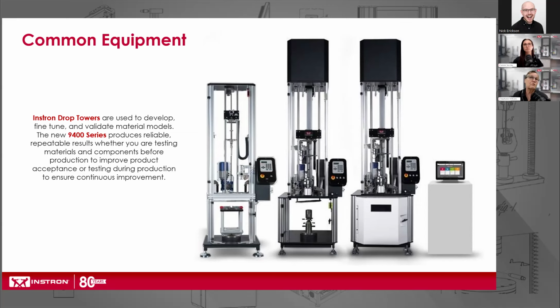As well, drop towers can be equipped with thermostatic chambers, so testing can be done at high or low temperatures. They may also be equipped with bigger bases to accommodate larger components or parts that would be under test.